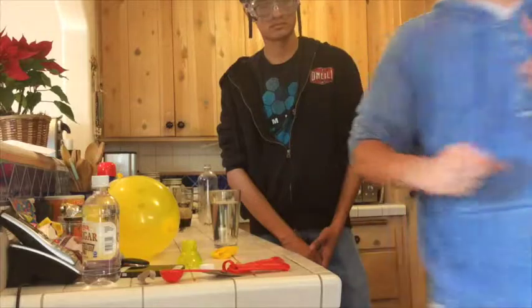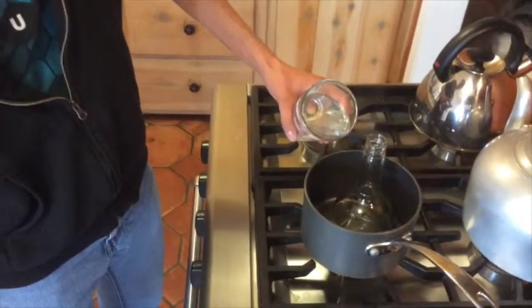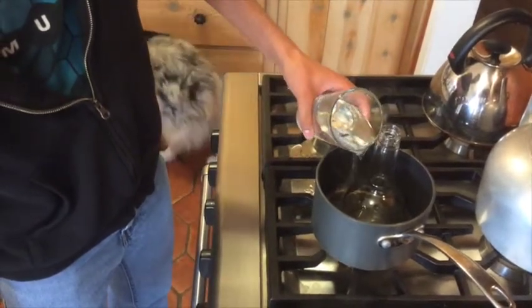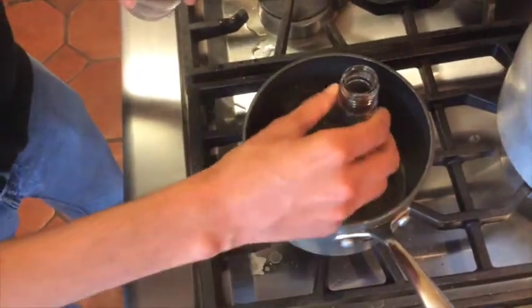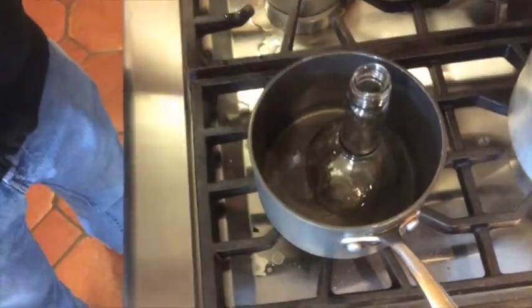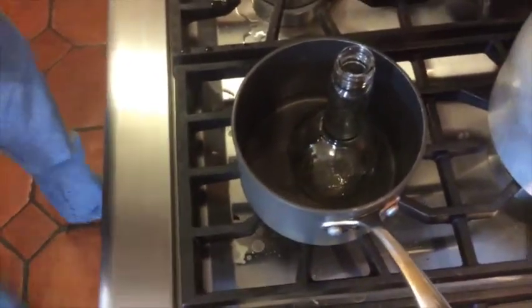All right, so wait 1 second. Royce is now pouring some of the water from the tap. Be careful, if it spills, just get the towel. He's just going to pour it in so that it covers the bottom of the pot, but not so much that it floats the flask. That's enough, as long as it covers the bottom. Now Royce is going to turn on the heat.